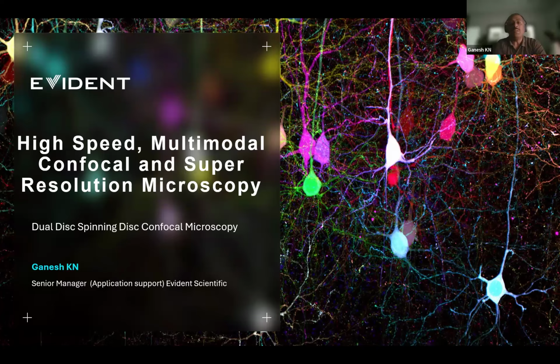However, live cell imaging has also become an integral part of biological science imaging, where people want to image live cells with the super resolution requirement. In addition to the spatial resolution that we are currently discussing in terms of nanometers, spatial resolution is not the only requirement of live cell imaging. Live cell imaging also needs temporal resolution, that means how fast you can image. But if you are imaging faster, you should also retain enough signal to noise ratio. You should have enough signal, lesser noise, and the resolution should not be compromised.